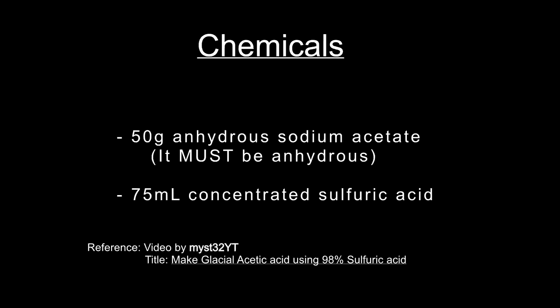You'll only need two chemicals, 50 grams of anhydrous sodium acetate and 75 milliliters of sulfuric acid. It is extremely important that the sodium acetate is anhydrous. If you only have access to sodium acetate trihydrate, you're going to first need to dry it in an oven.